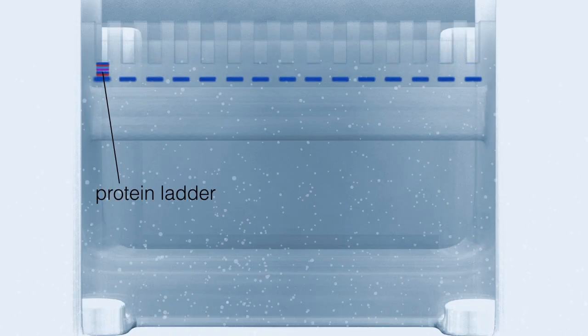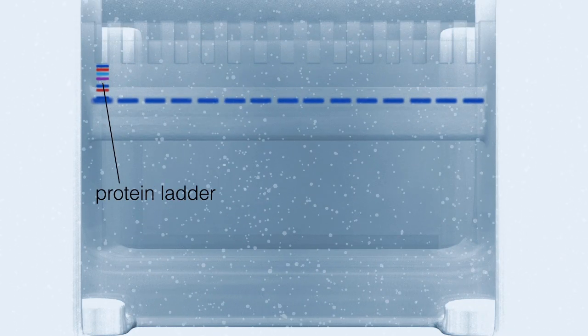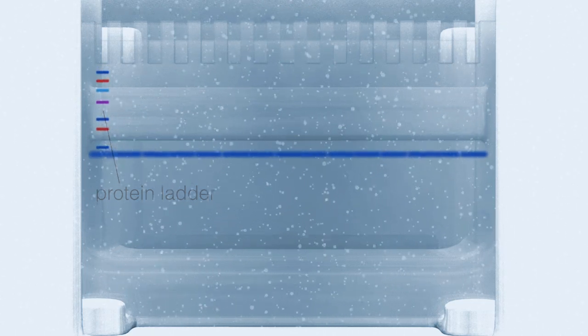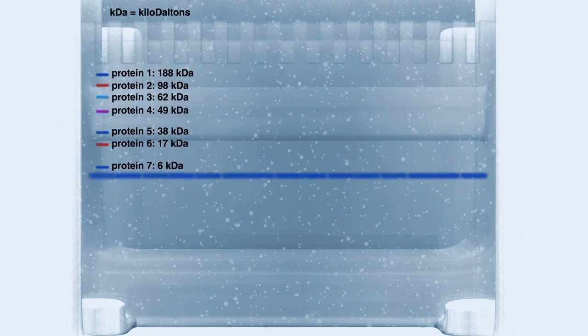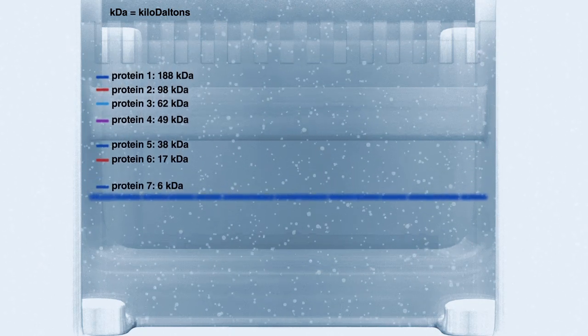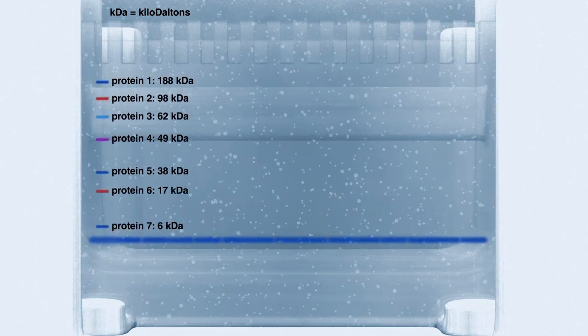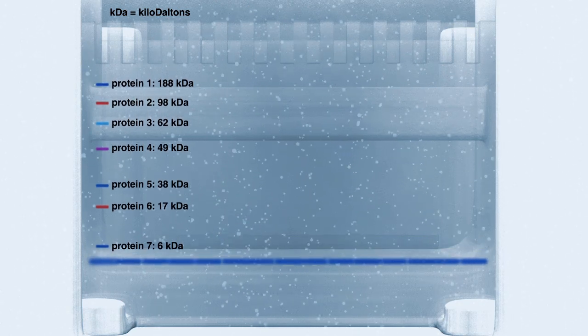To assess the molecular weight of a protein after gel electrophoresis, a sample called a protein ladder, containing several pre-stained proteins of known size is loaded and run along with the experimental samples. The use of protein ladders with pre-stained proteins increases visibility and facilitates monitoring of protein migration through the gel.